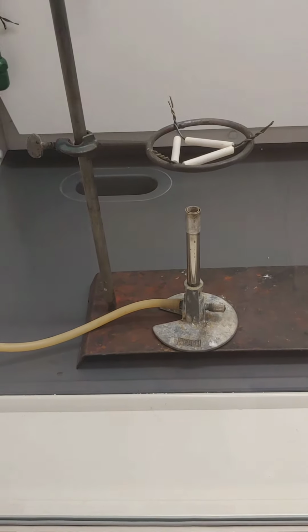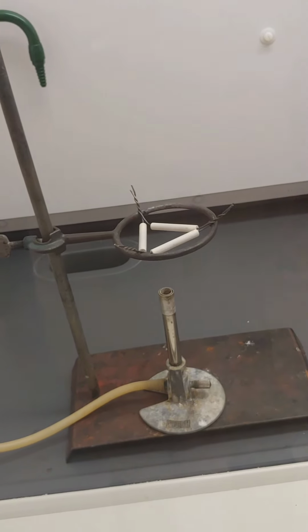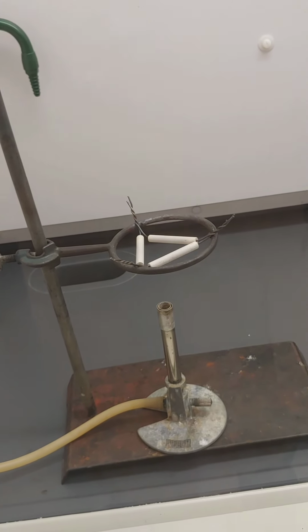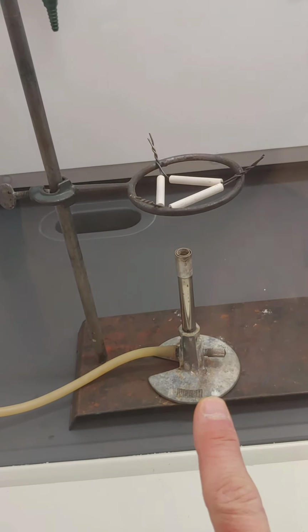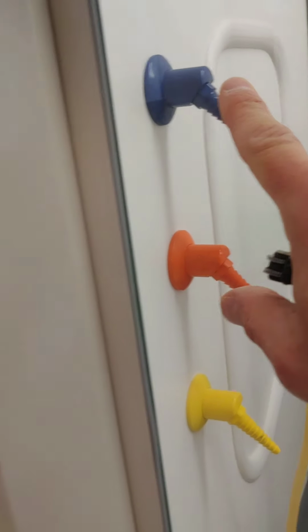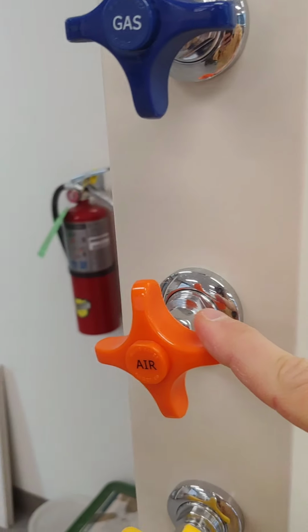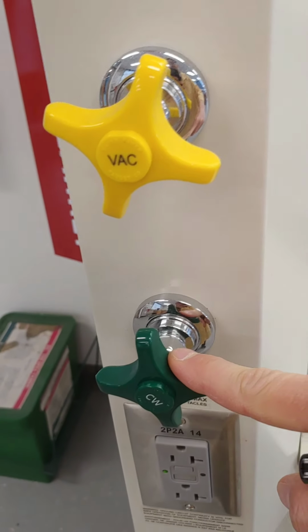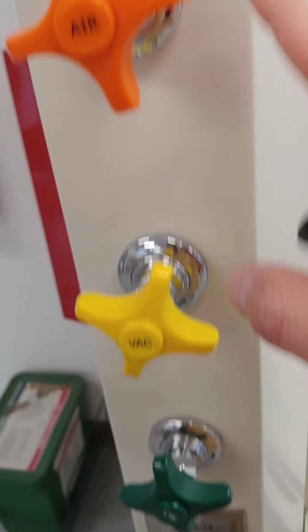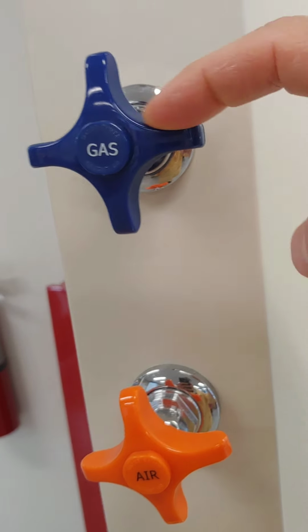Here's my setup inside of the fume hood, and I've got the sash closed here because I didn't want too much sound coming out so that it would be difficult to hear. But you can see I've got a ring stand. On top of the ring stand I have a Bunsen burner, and that's connected to the blue valve inside. The gas is typically blue in the laboratories, air is orange, vacuum is yellow, and cold water in this case is green. So things are usually color coded. The blue knobs are the ones that we use for the natural gas.